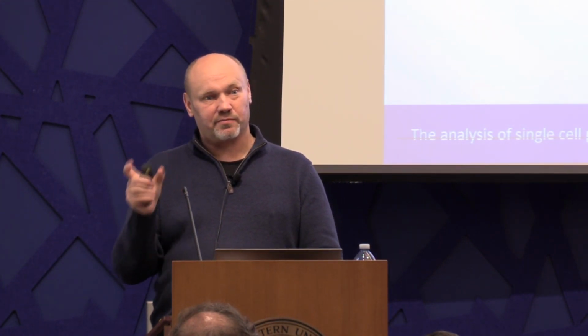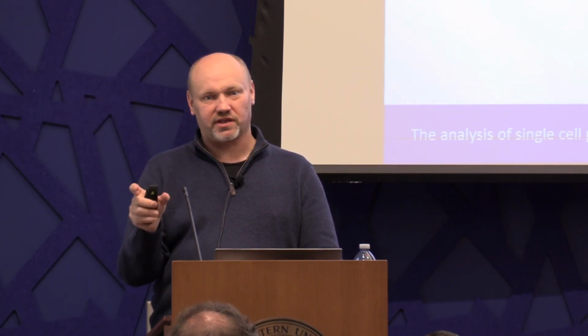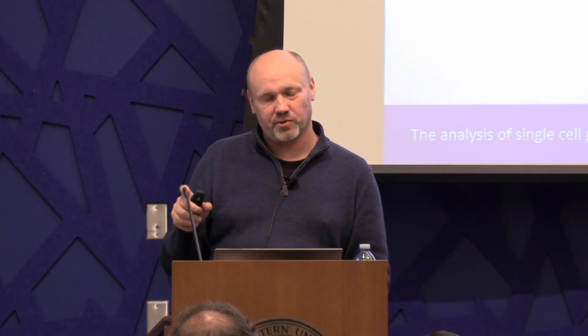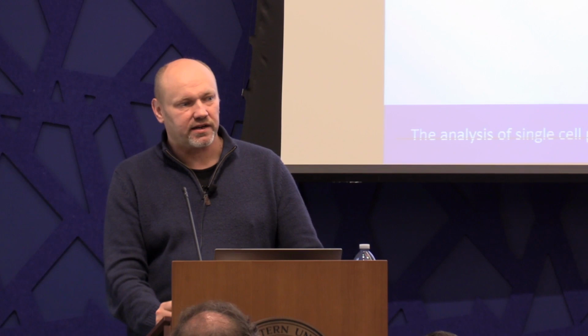And actually you don't care if it's coming from a low abundant SILAC pair or from a high abundant SILAC pair, because even if you have a low abundant SILAC pair, you're pretty sure that this exists. You saw heavy and light, a few isotopic peaks for both, and you can do decent quantification even if it's low abundant. So that's why it's actually good to take the ratio of all of the PSMs and then just take the median, no matter how abundant it was, right? So for SILAC, dimethyl, and these things, that's the way to go. That's the best, at least in our hands in MaxQuant, it's the best way to quantify SILAC-labeled proteins.